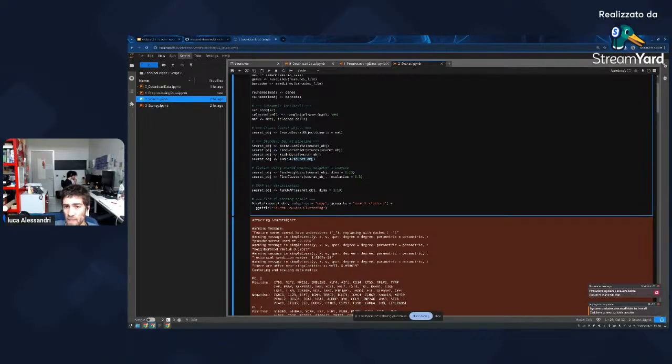Because this one is actually performed in order to project our data on a lower dimensional space, but it will not be used to visualize the data. Seurat used this function in order to reduce the space and try to remove the noise and take only what is important from our data. And then here we can do the clustering through these two functions over here that, of course, always use the Seurat object. And these dimensions over here are how many dimensions from the PCA we want to use.